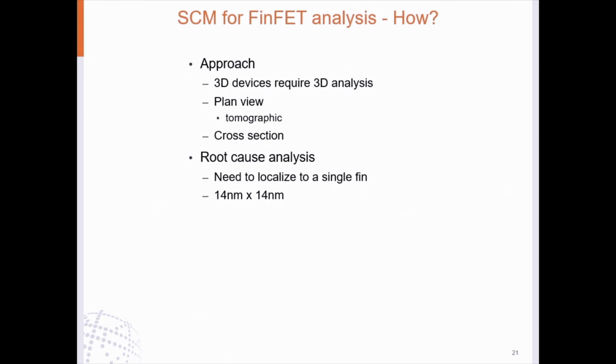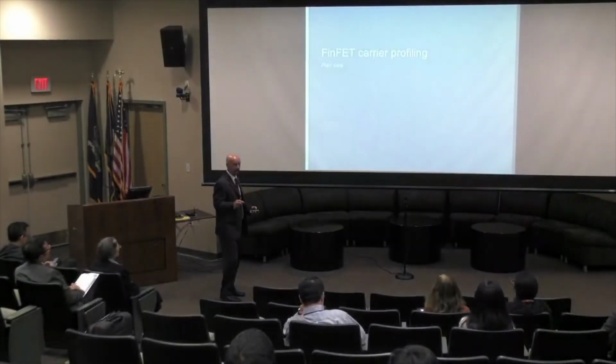It requires three-dimensional analysis. Do we analyze in plan view and do a tomographic reconstruction, or do we look at these cross-sections? We don't know. But we do know that in cases we're going to need to characterize a single fin. And those fins are 14 nanometers by 14 nanometers at their smallest dimension, at their critical dimension. So 26 atoms by 26 atoms.